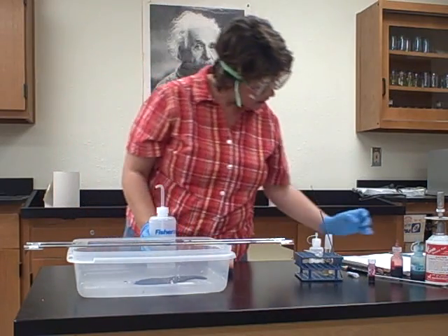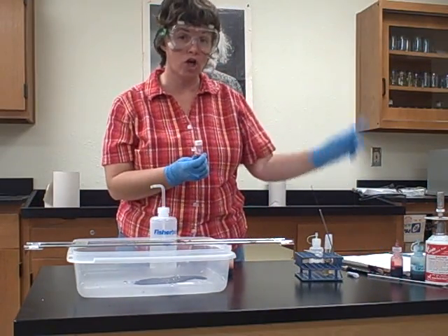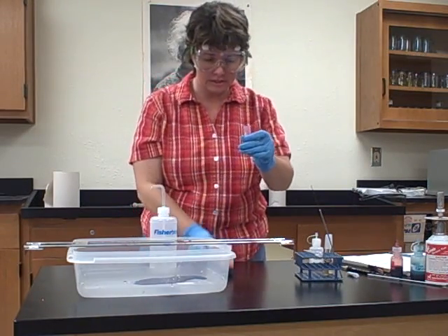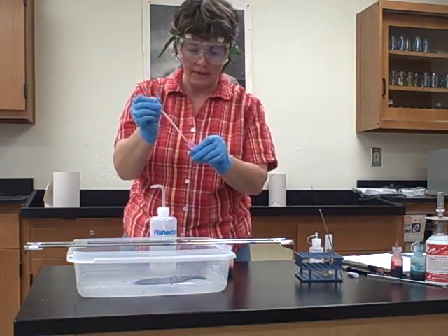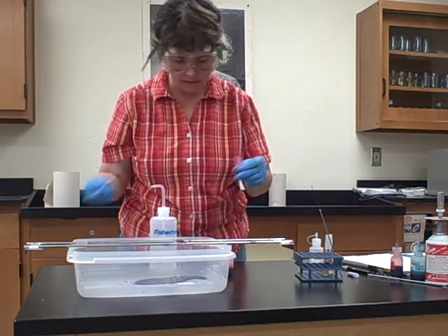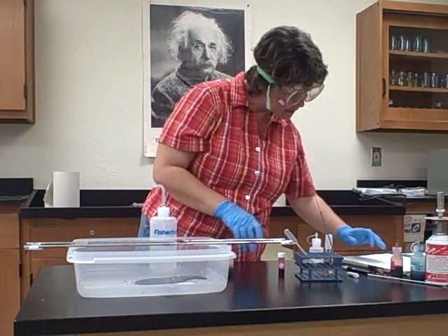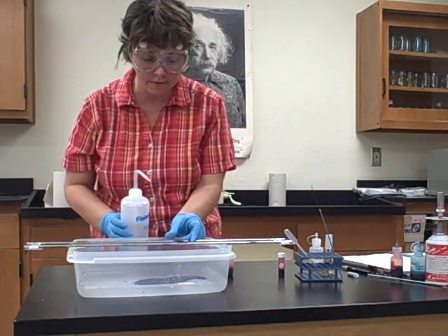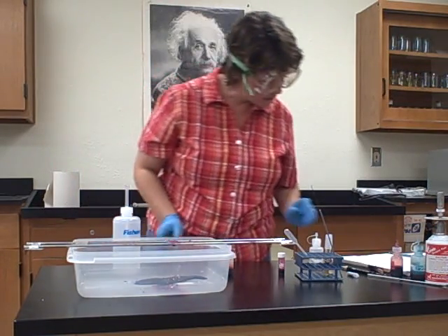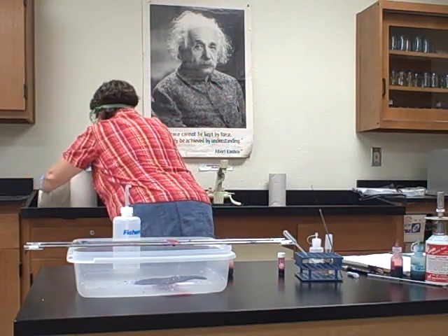Okay. And then it says cover with acid fuchsin. Remember, earlier we used carbol fuchsin. Now we're going to use acid fuchsin. This one doesn't come in a dropper, so I'm just going to use a pipette for it. So then we're going to put the acid fuchsin on, and it says for a minute. Okay. Wash the smear with distilled water, so it sat for a minute. Wash with distilled water. Okay, and then it says examine under the microscope. Well, we'll go ahead and let it dry first.